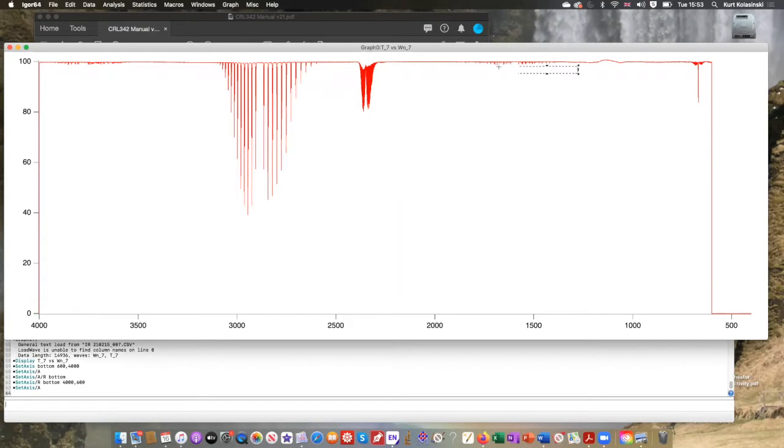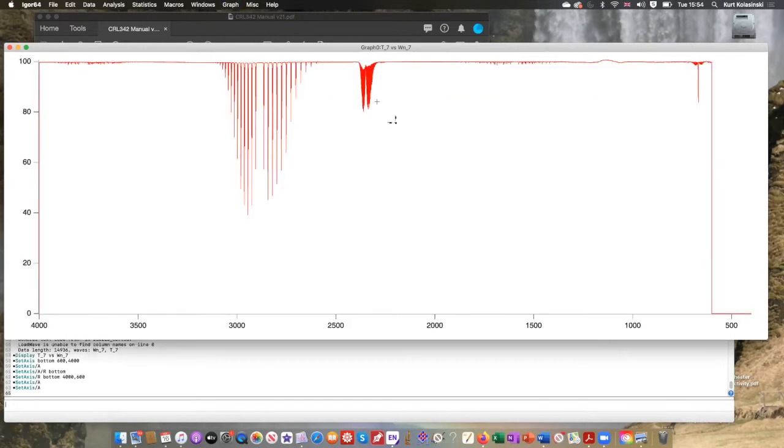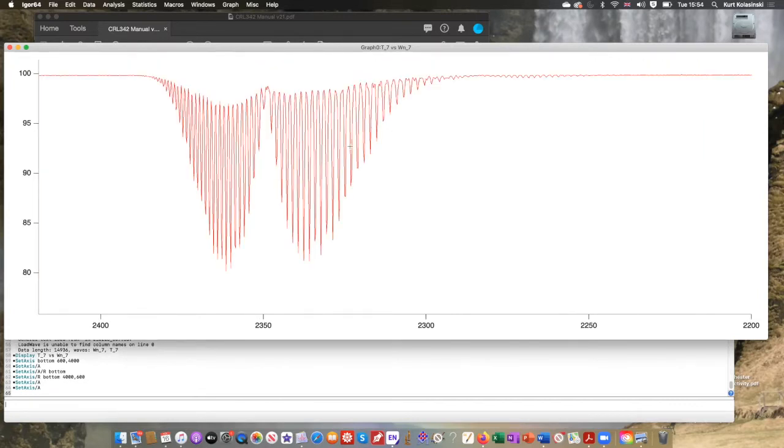No, I've got some lines here. And these lines don't seem to have much of a pattern to them, right? We're talking some really small lines here, and I don't see much of a pattern here. Whereas if we look at this section, the pattern's pretty obvious, right? There's a branch here. It's like it's missing something in the middle, and then another branch over here. There's something maybe repeating down there. Kind of interesting how we're seeing these patterns.